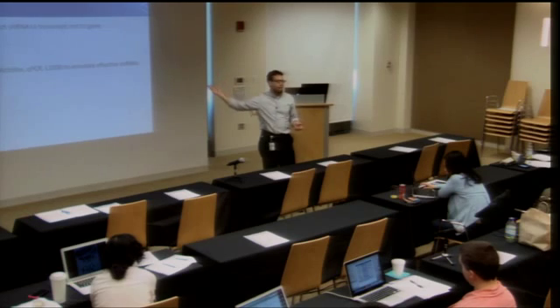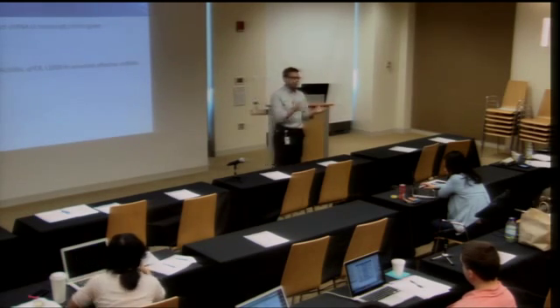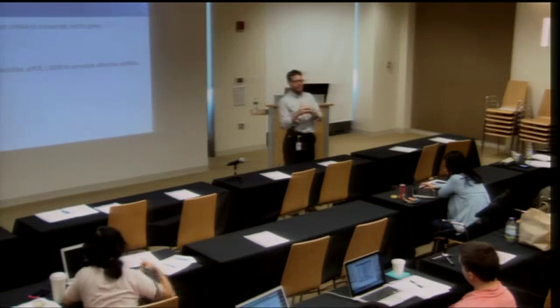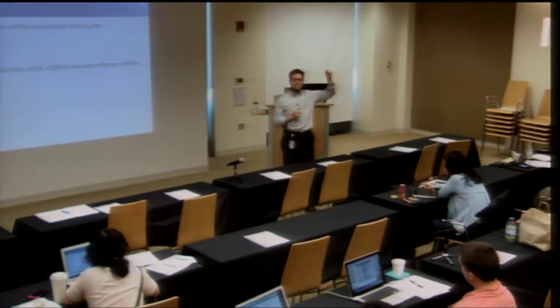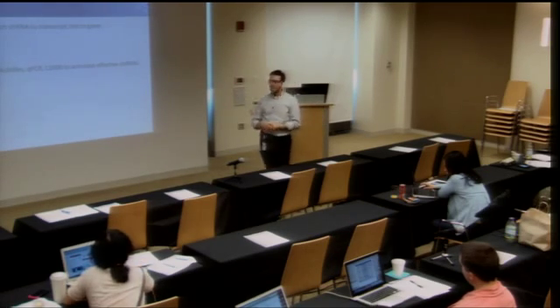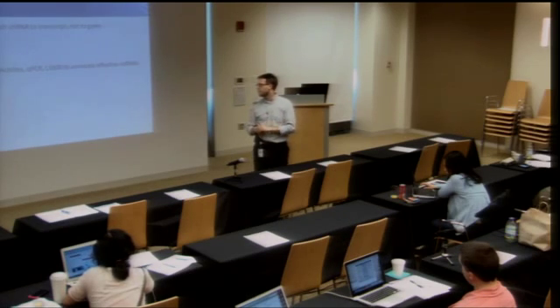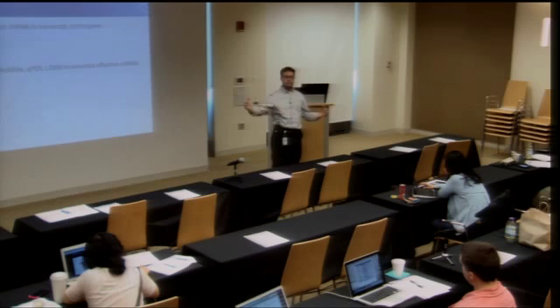I already mentioned that we have this huge data set of qPCR data, to get a sense of whether it's on target. If a hairpin isn't knocking down its gene, then it's not likely to be an on-target hit. Dave mentioned the L1000 assay. If you've heard about it, it's a very large data set looking far more deeply than anyone ever has at how well shRNAs are working across many different cell lines in a very deep readout of gene expression.